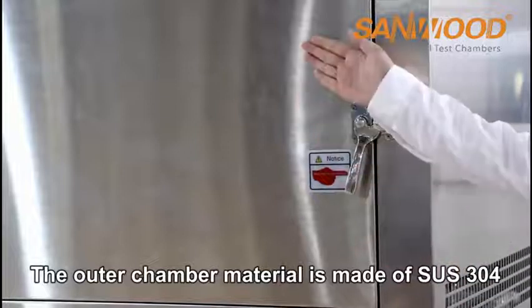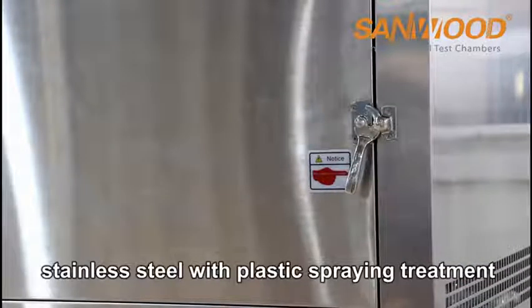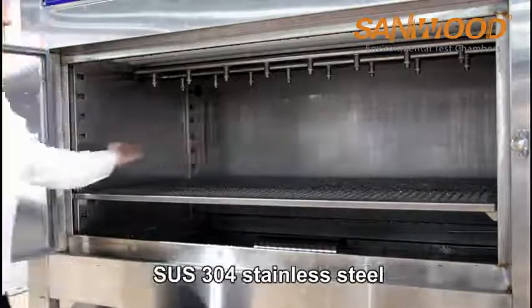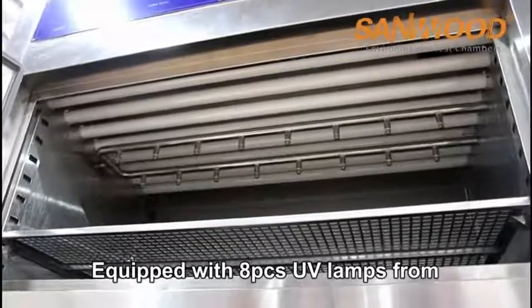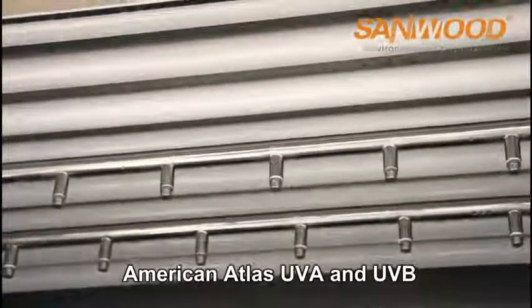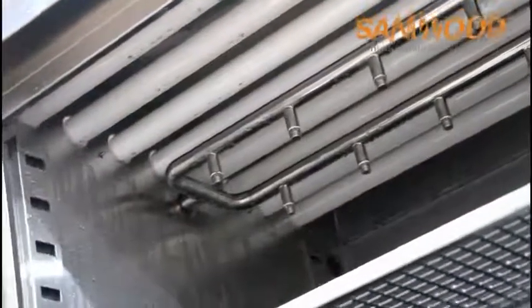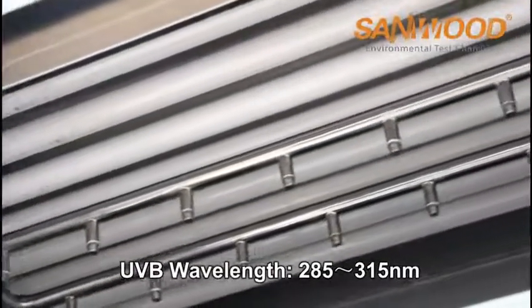The outer chamber material is made of SUS304 stainless steel with plastic spraying treatment. The inner chamber material is also made of SUS304 stainless steel. The machine is equipped with 8 UV lamps from America's Atlas, including UVA and UVB types. UVA wavelength is 315 to 400 nanometers, and UVB wavelength is 285 to 315 nanometers.